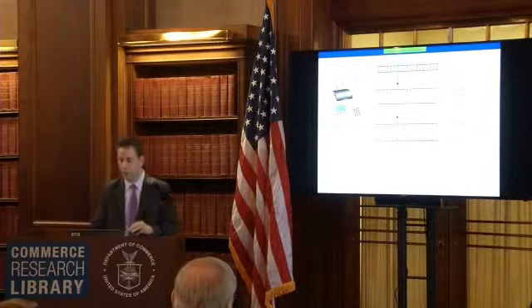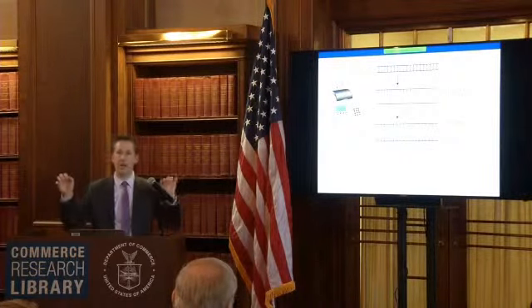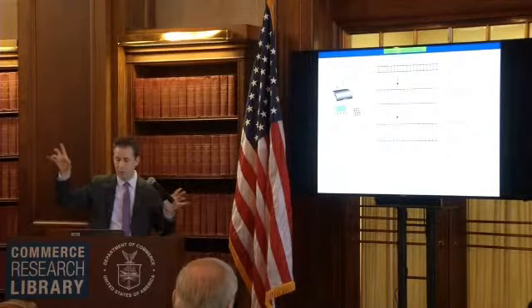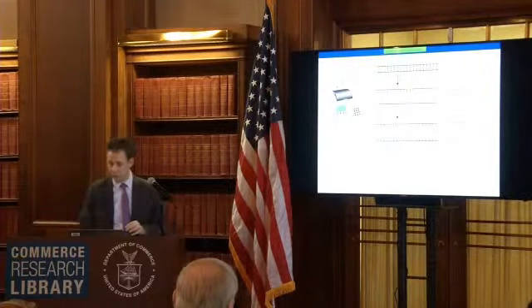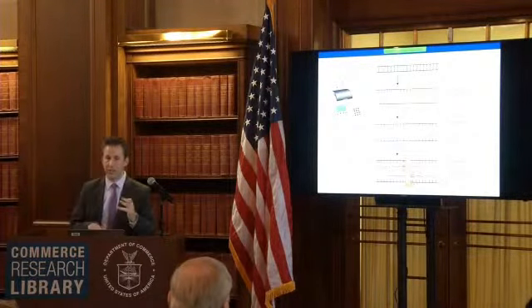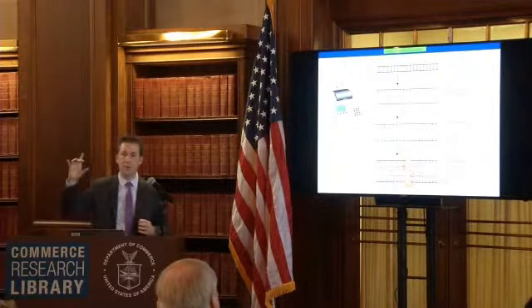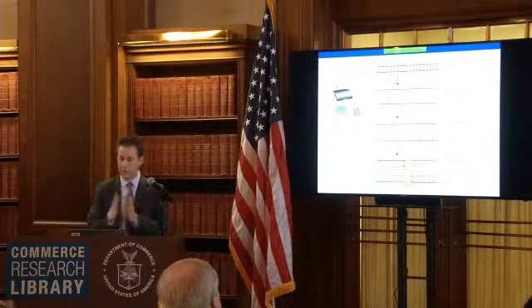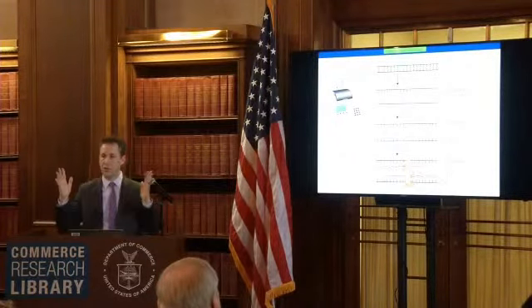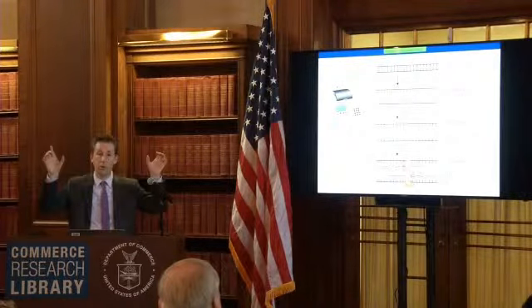And then you have a cooling, and you have these things called primers. Those are regions that are outside, that bound the STR repeat region. Those stick to the DNA that you just denatured. And then you have what's called a polymerase and the A, G, C, and T, the different chemical moieties that are in there. What happens is the polymerase, using the template that you denatured, makes a new strand. So you're basically breaking these apart, binding primers, and then each of those strands that have been broken apart makes a new double helix.